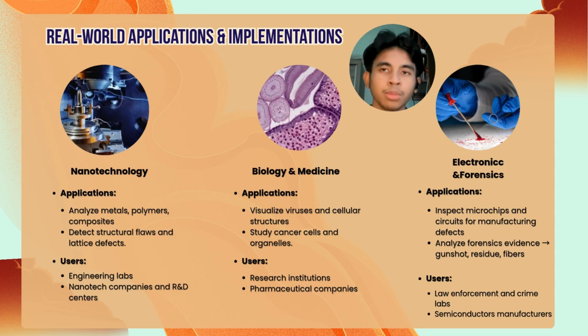So moving on, the application for biology and medicine is that it visualizes viruses and cellular structures. It is on a microscopic level, and it also studies cancer cells and organelles like mitochondria. The users of this are research institutions and pharmaceutical companies. In the university, they also have this.